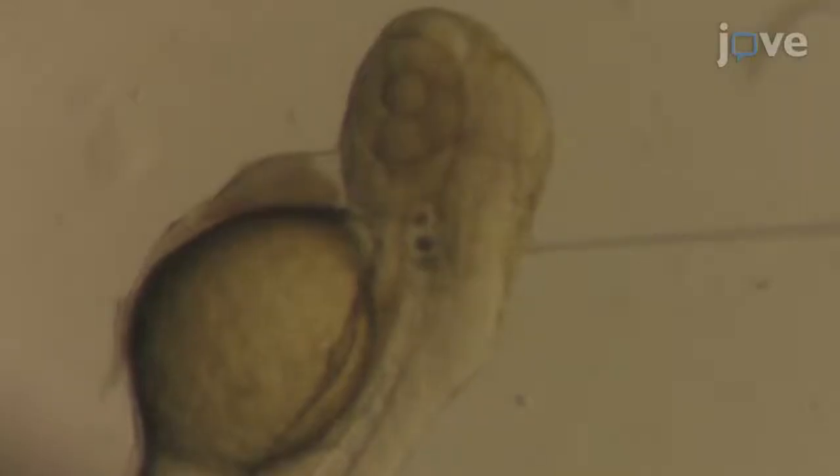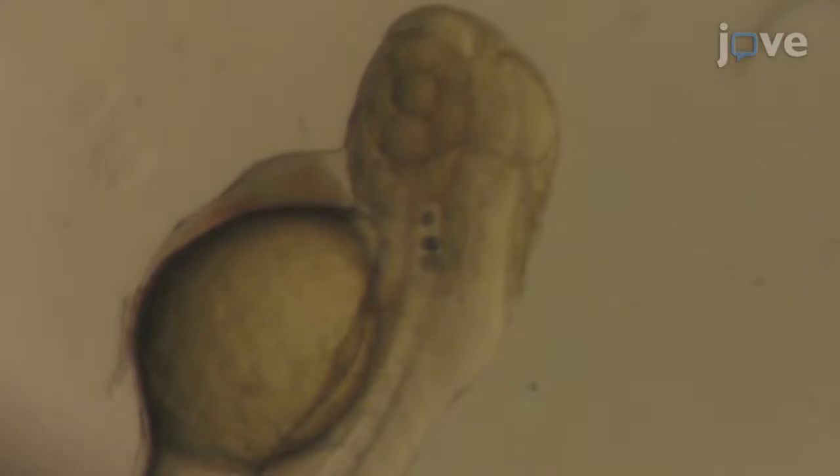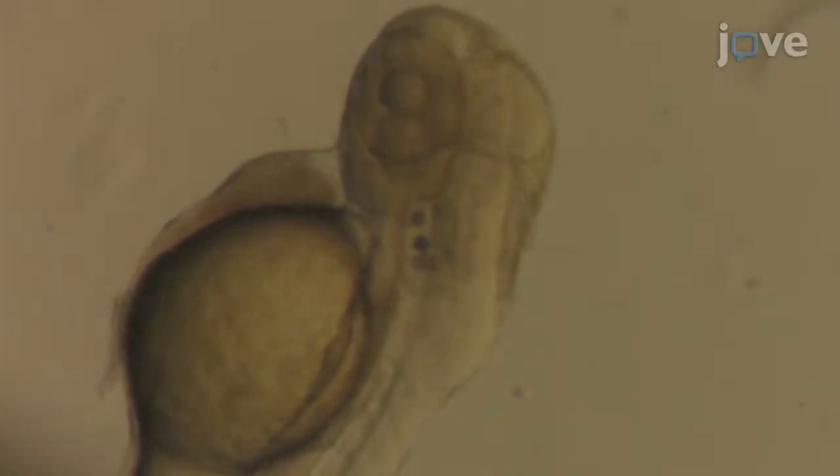When applied to zebrafish models of disease with an inflammatory component, this technique has the potential to resolve how macrophages contribute to pathological processes. Here we demonstrate the utility of this technique by targeting a mitochondrial reactive oxygen species inhibiting drug to macrophages to suppress activation.